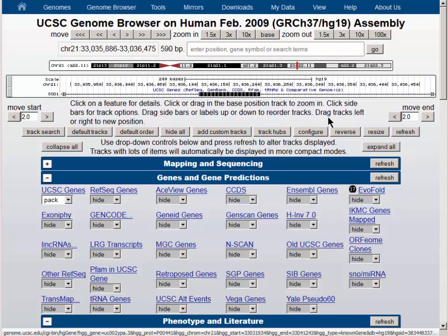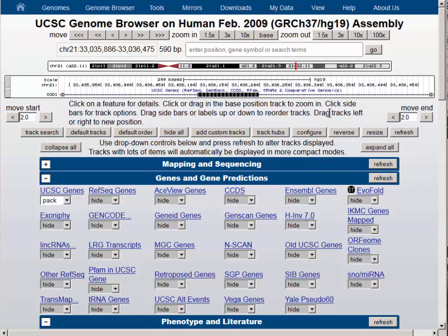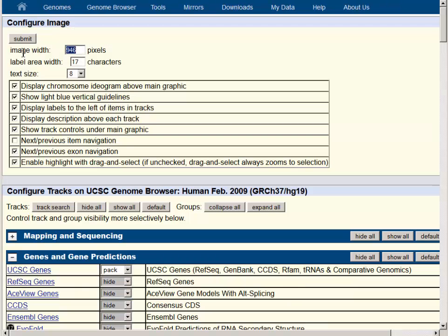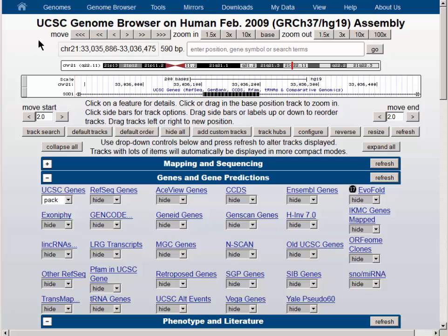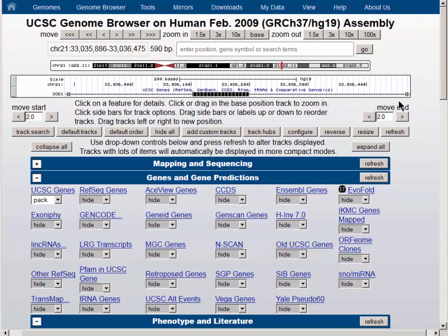As the arrows are off the screen in this configuration, let's configure it to make the graphic a little bit narrower — we will make it 880 pixels wide. Now you can see that on the right-hand side of the screen the arrows are a little bit further over, and the mouse over shows us that the next exon is number three of five.